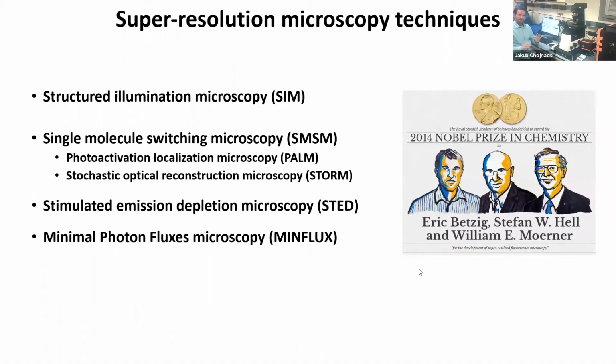One of the super resolution microscopy techniques that I will briefly introduce to you is STED microscopy, stimulated emission depletion microscopy. This microscope that we have here is not only a standard confocal fluorescence microscope, it is actually a super resolution microscope, which means it is not only capable of standard fluorescent confocal imaging with a normal resolution of 250 nanometers, but it's also capable of super resolution microscopy. That is going to be very crucial for us when we look at the viruses.